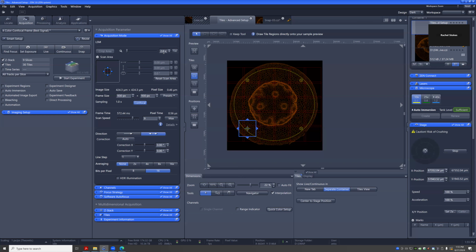It does change when we change the zoom. The zoom only makes the scan area smaller, it doesn't really change the resolution. Right, a bigger area will give you more pixels, but the detail that the pixels resolve is going to be the same. That's a good question, because I think it's often something people run into, like, oh, I'll just zoom in more. But it doesn't work like that. Physics will at some point stop you from seeing more with that lens at that wavelength. So that's really the key.